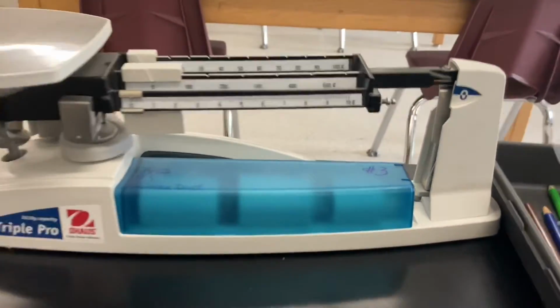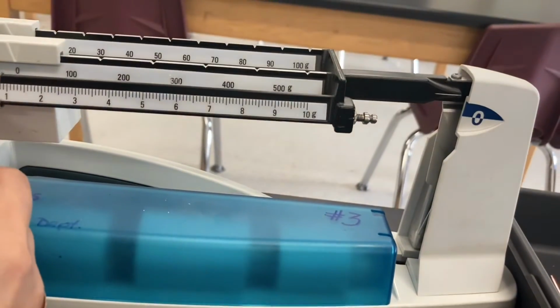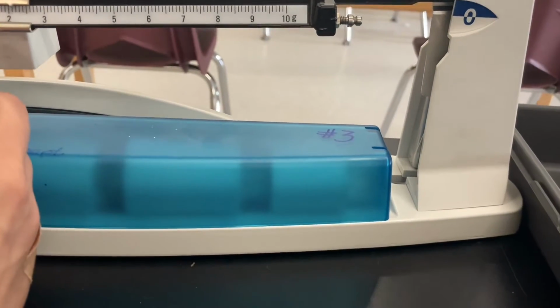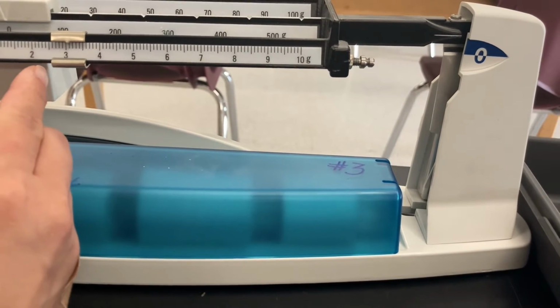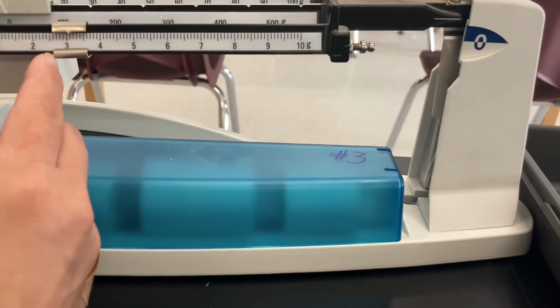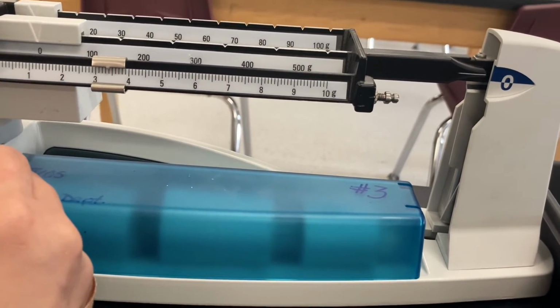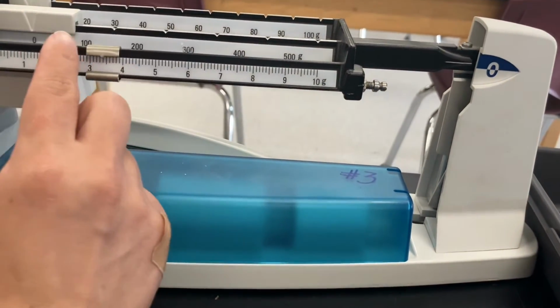All right, as we can see, it's definitely not zeroed out, so let's adjust it. We're getting close. So close, just a little bit more.